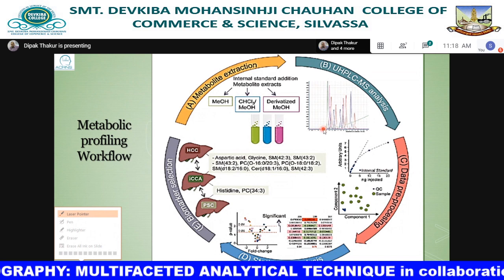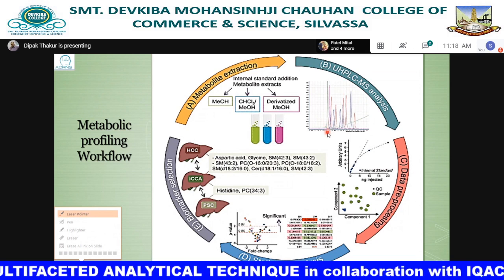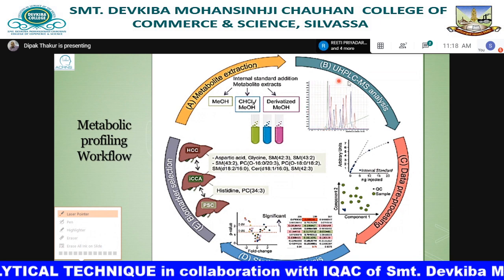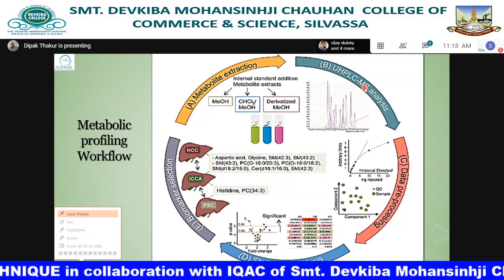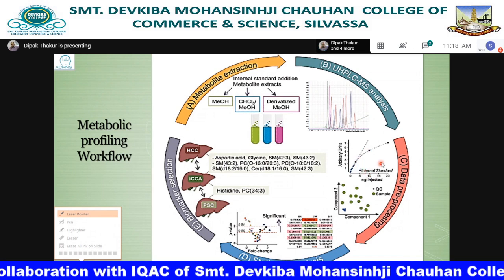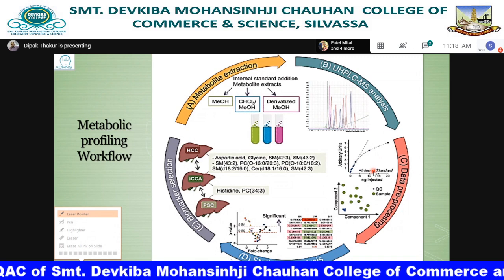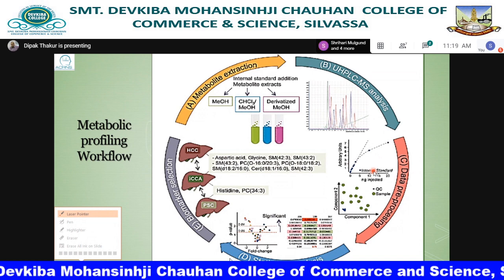So the compounds eluting in this peak, which can be hundreds of compounds, are separated by the mass spectrometer because they have different mass to charge ratios. So the HPLC or separation column connected with mass spectrometry provides two dimensions of separation. See here the role of the internal standard. It helps in quantitation because we know the quantity of internal standard added, and that helps us calculate the amount of metabolites and their concentration in the sample.